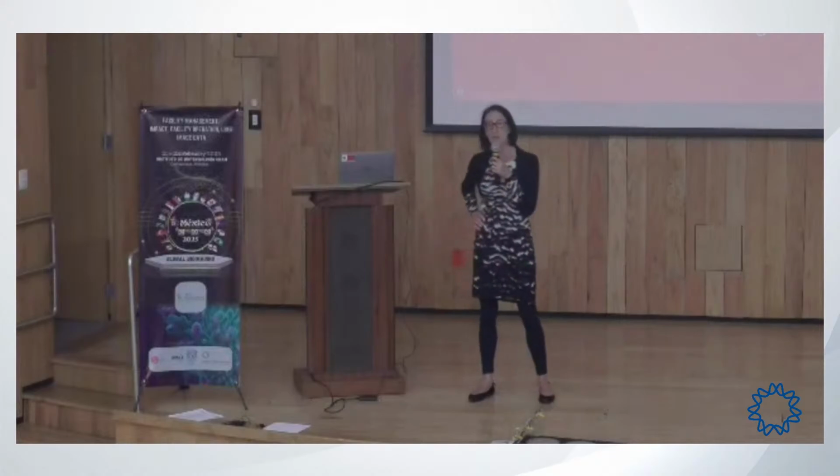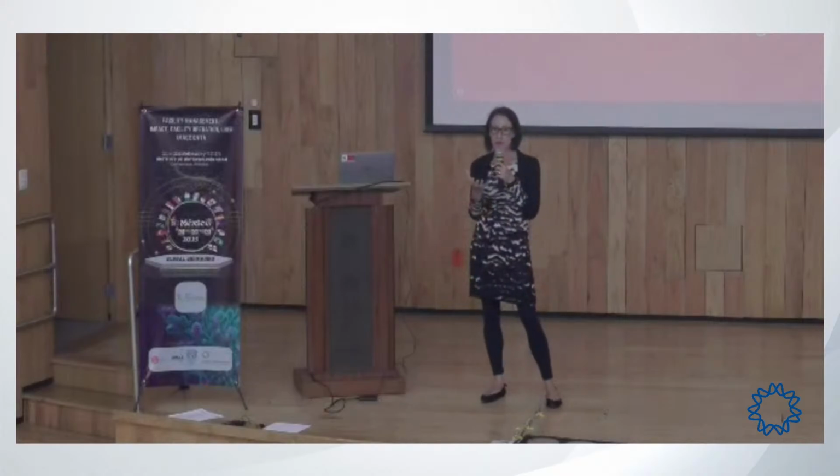That's a very good question too. We have plenty of algorithms when we are correlating the data from the light microscope into a transmission electron microscope, or the thing that we call CLEM, or even when you prepare the lamella, you need to have that correlation. So we have plenty of algorithms that can help us, with fiducials as well, to understand where the area of interest is and where we need to prepare the lamella. Or if you don't want to prepare the lamella and you go directly to the transmission electron microscope and do CLEM directly, we have that correlation because we have the algorithms and the fiducials. So yeah, of course.